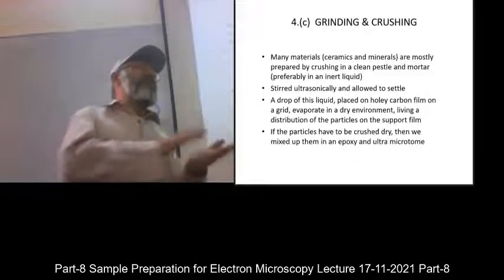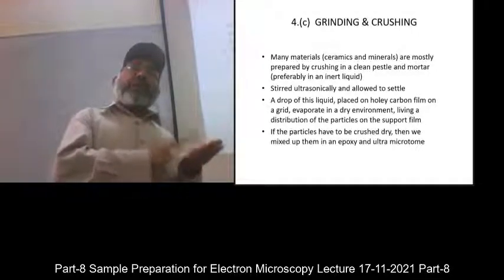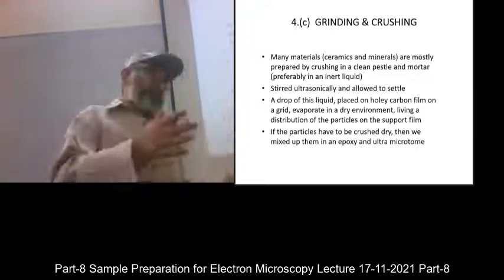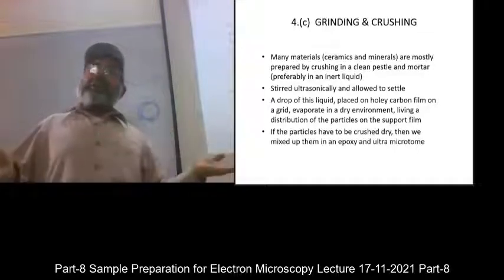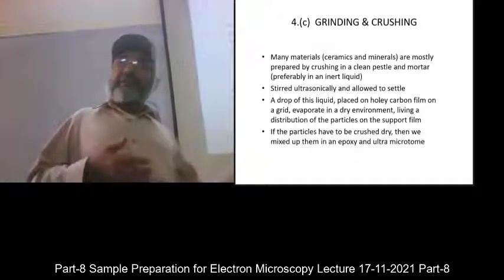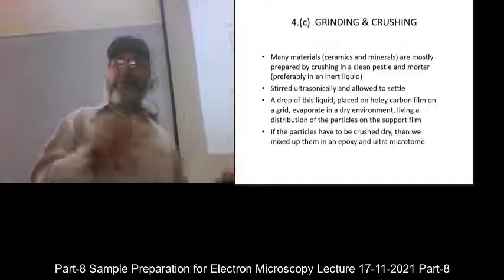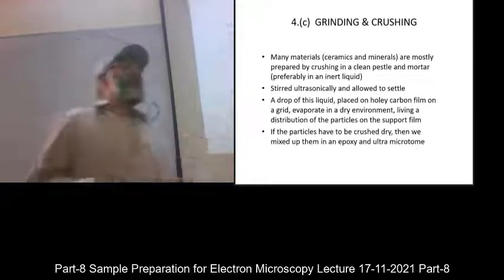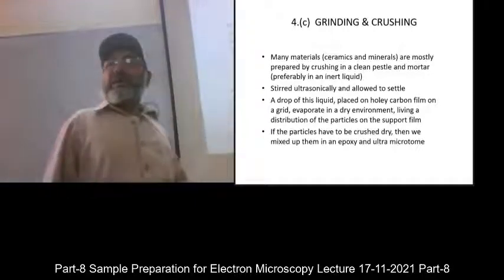You will not be able to see the original sequence of crystals which are seen in the self-supported sample. But if you are fortunate, you will see some particles which are thin, and you can see things. And I have done many samples like that, and I have got enough information from them as well. So it is not completely useless, but as a teacher I will tell you, go through a difficult way, but a more reliable and authentic way.